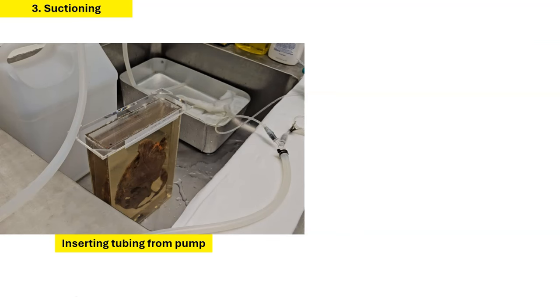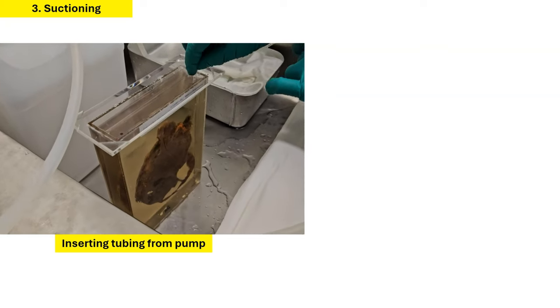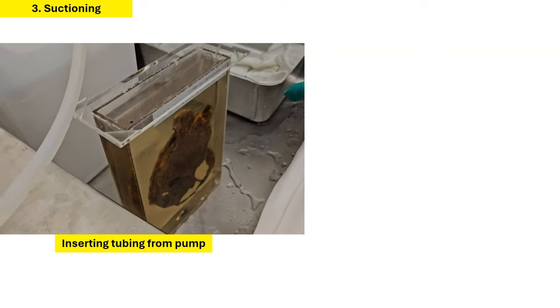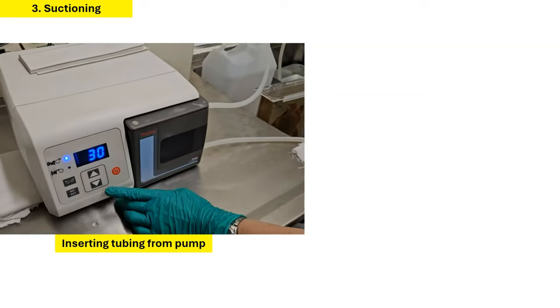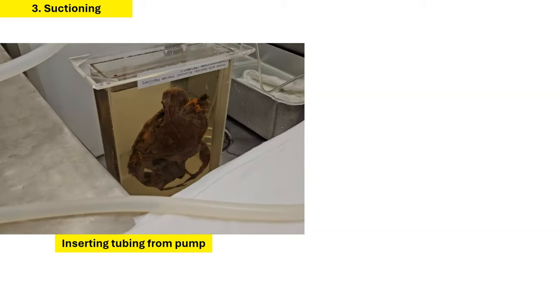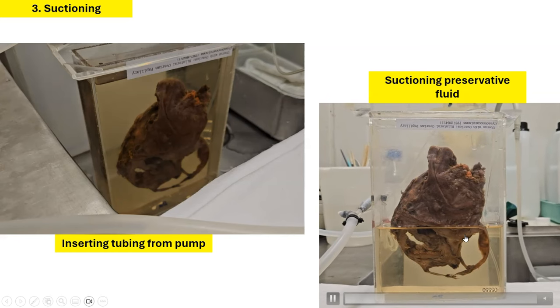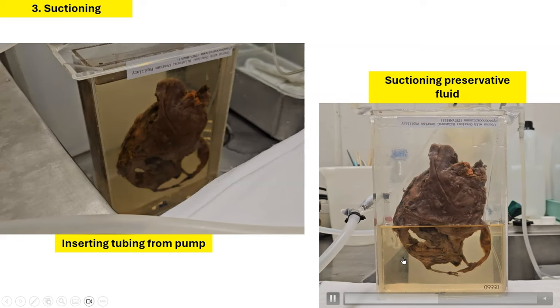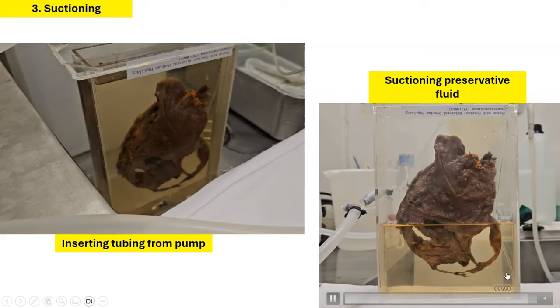The next step is then to insert tubing from the suction pump into the specimen container. And this is how we drain the discolored preservative fluid. After this, we can suction all the fluid out of the container. This helps us to get rid of any discolored fluid and sometimes also some debris that has fallen into the fluid.